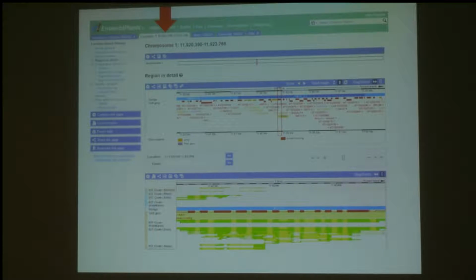If we look at the transcript tab, you can see that the box on the left has changed, and we have a different set of information available. So we have sequence information. We also have information about the protein domain, so this might give you more clues about what the functions of this gene might be. And if we go to the third tab, which is the location tab, we can see where our gene is in a genomic context. Here you have GBSS1 right in the center, and you can see all the other genes that are located near to GBSS1 on the chromosome.